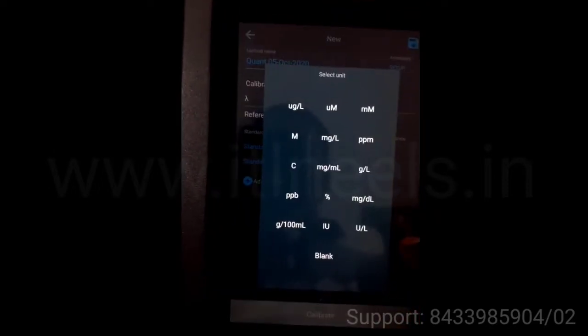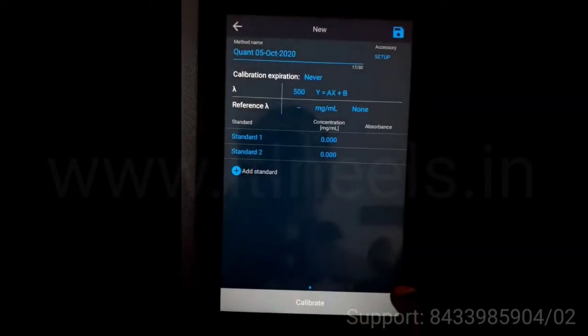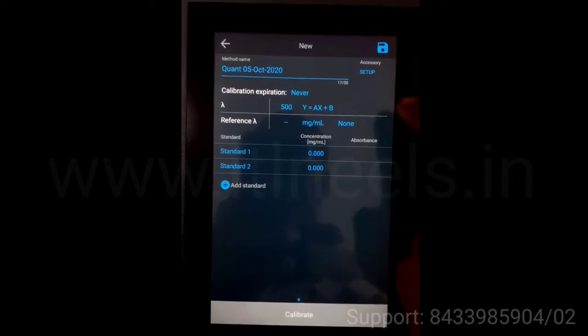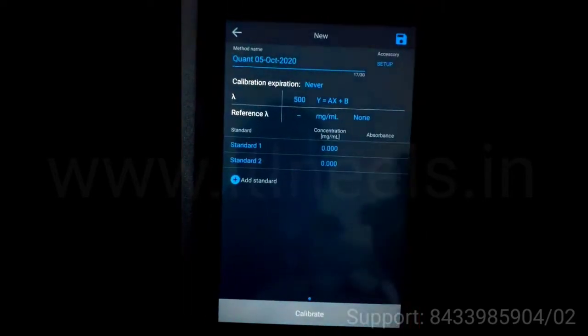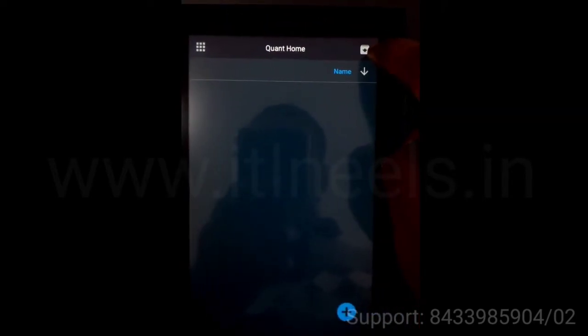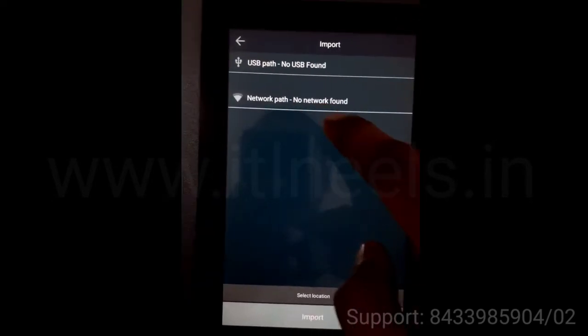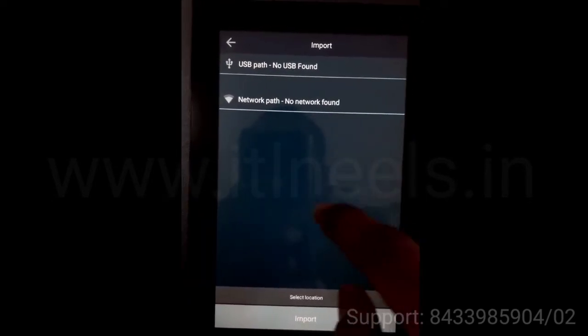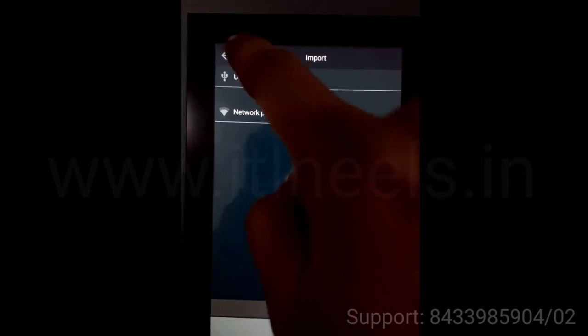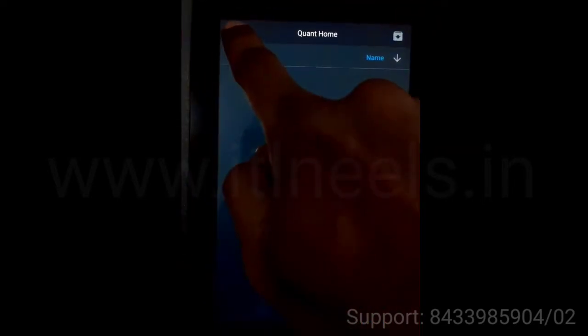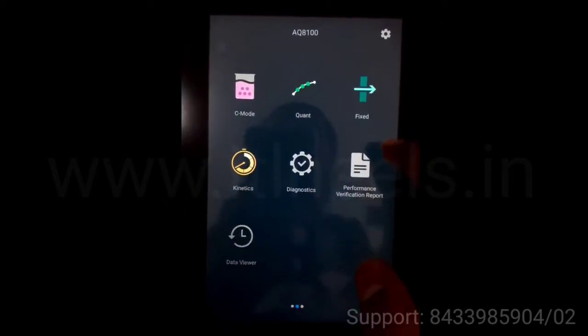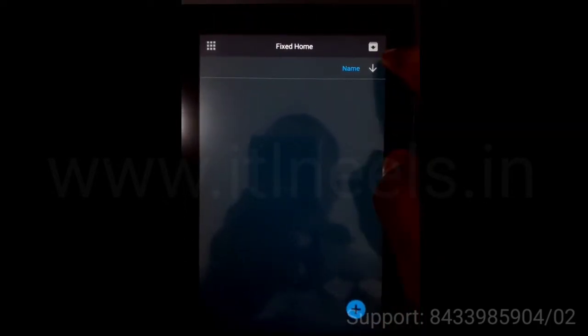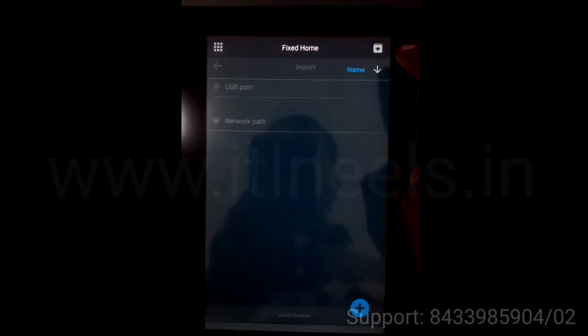You can change the unit. You can save the method also. You can export it or import it from the USB or the network via WiFi. Next is the fix method. In this also you can import it from the USB or the network.